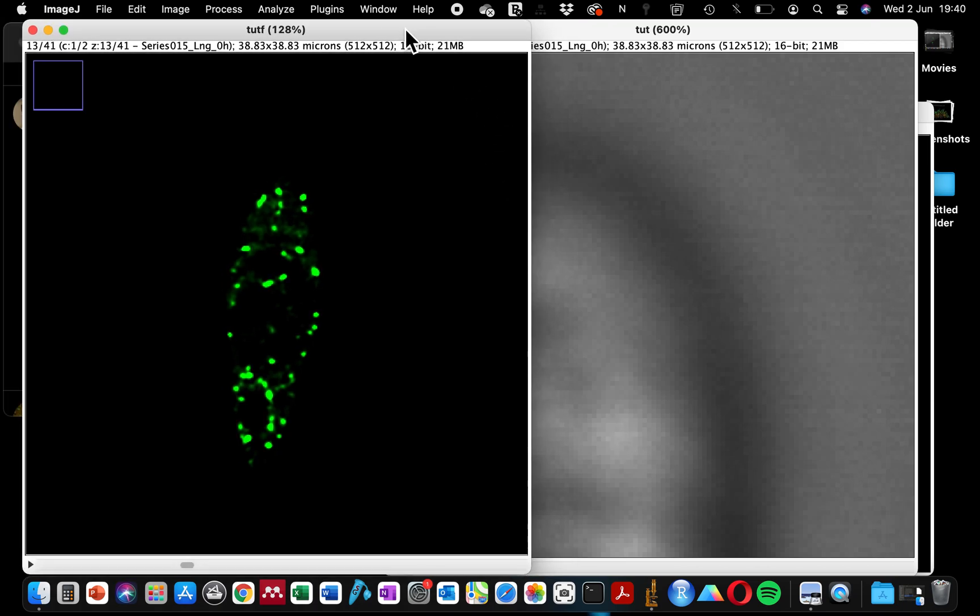Hi, welcome to my YouTube channel. My name is Alice Rita and today's tutorial is going to be about color coding of Z-stack images. I'm going to show you how to use ImageJ to perform color coding of your Z-stack images.